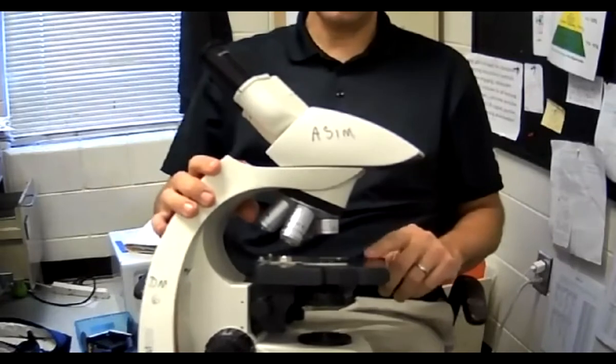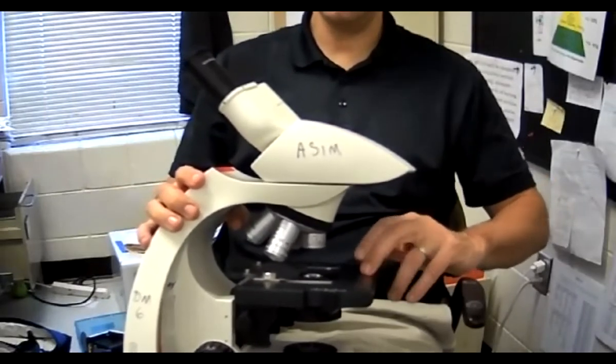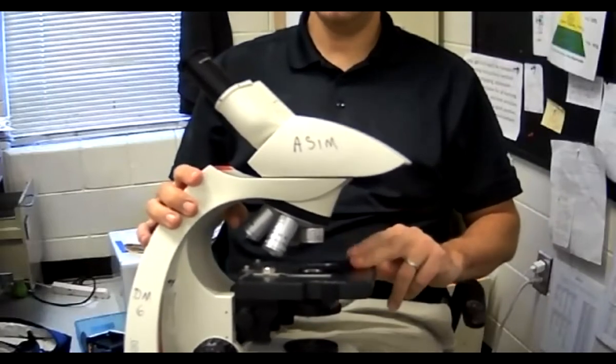This next part right here that I'm touching — what I'm tapping my fingers on — is the stage. This is the stage.